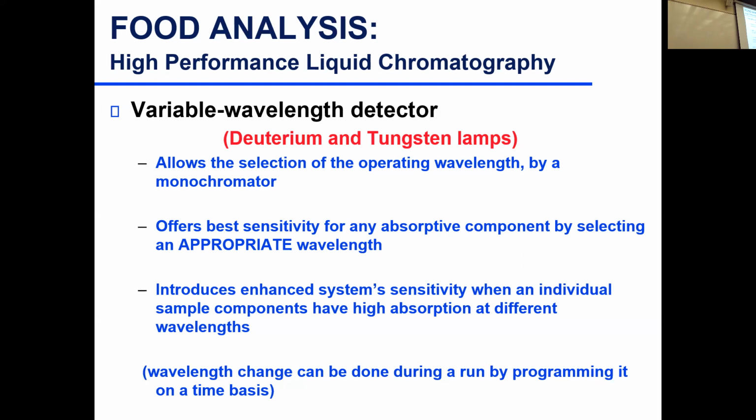All right, so you have your lamp, which is your source of light. Not a very good drawer. So you have your light, and it's made up of multiple wavelengths. You get to a grating system, and the light diffracts into individual wavelengths.